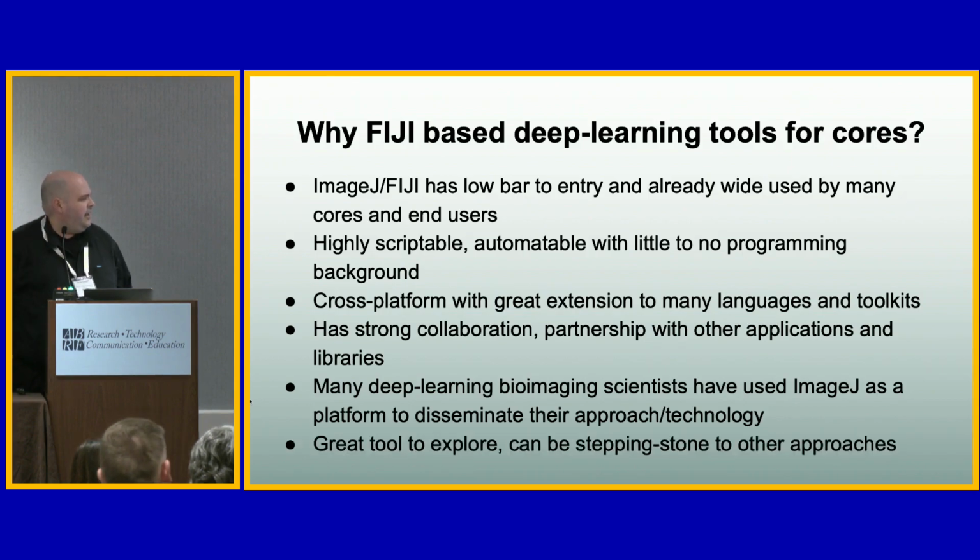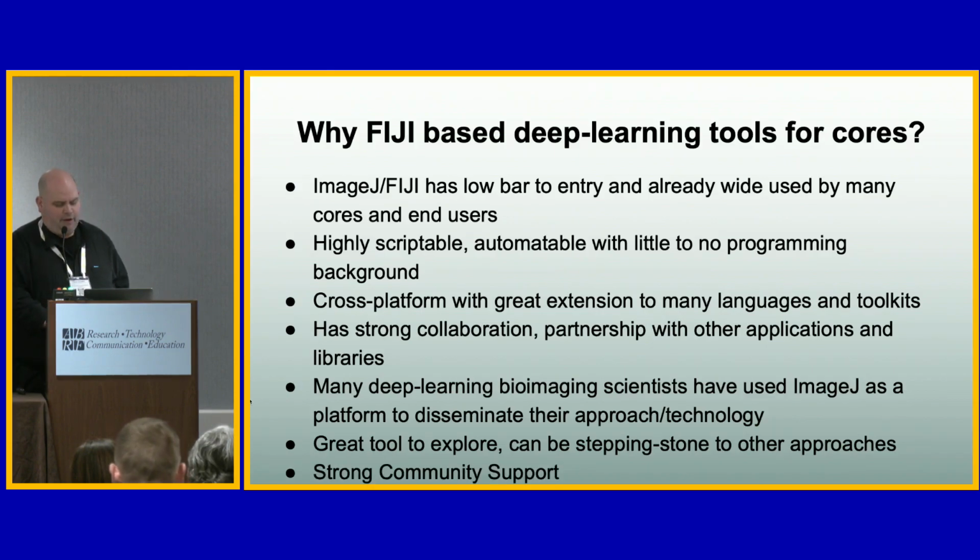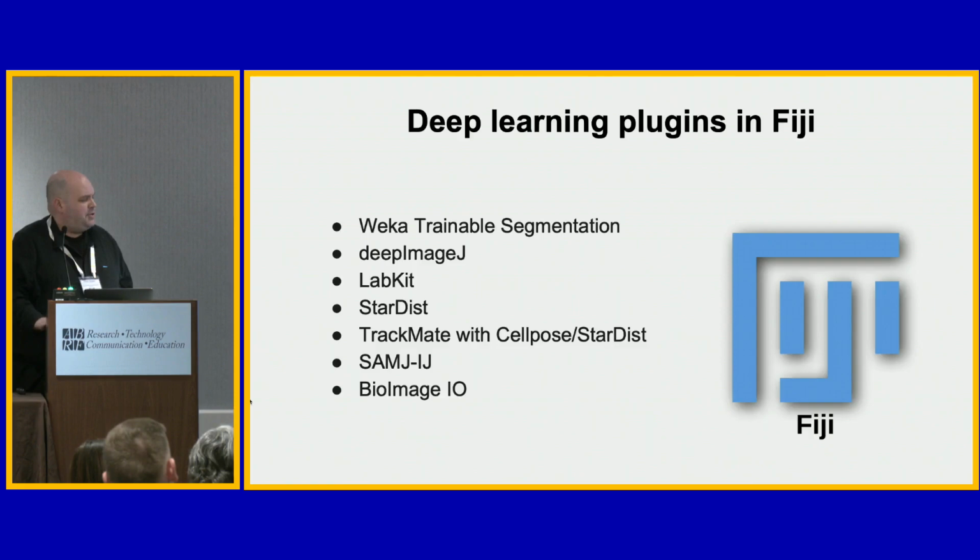In my opinion, it could be a long-term tool for you, but it also could be a great stepping stone tool. You can play around in ImageJ with deep learning and then graduate, if you will, to another tool that might fit you better. And again, strong community support. So I'm just going to quickly go over a few deep learning plugins in Fiji, and then we'll have a panel afterwards of the three of us where we can all discuss it after Thomas's talk.